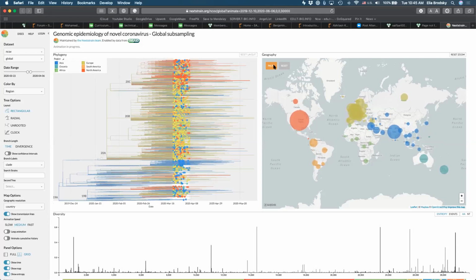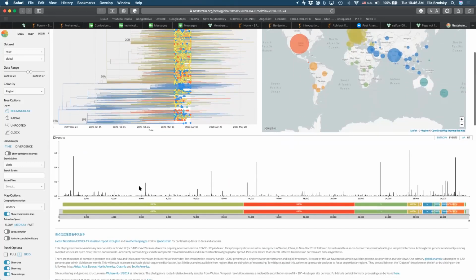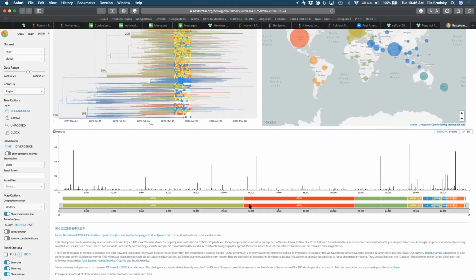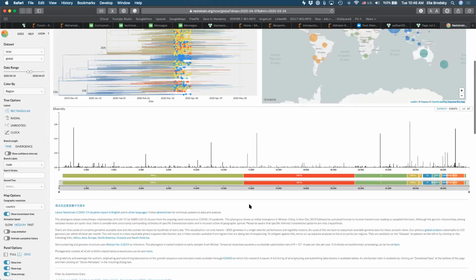So this is just a useful visualization tool for us to understand how all of this type of information is linked together and start looking into greater detail at the genome of this novel SARS coronavirus. This site also contains all of the data, and you can actually download all of the data, including the individual genomic sequences that we will be analyzing in this program as well.